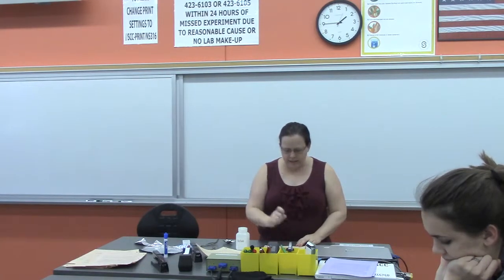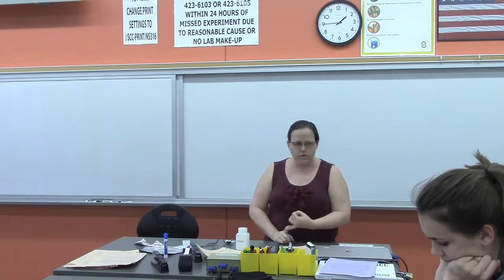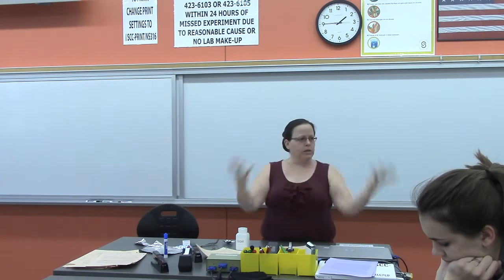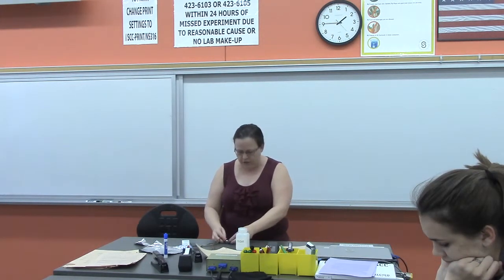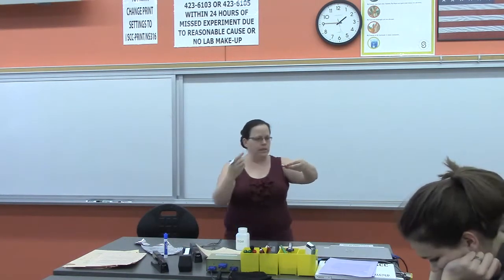The last one, it says behavior upon heating. So it's important to note whether a substance melts when you heat it up, whether it burns, catches fire when you heat it up, or it decomposes. It comes apart into its components when you heat it up. So we're going to take that little aluminum foil square, we're going to add our little crystals to it. After you've made all your observations, then we're going to see what happens when this heats up.